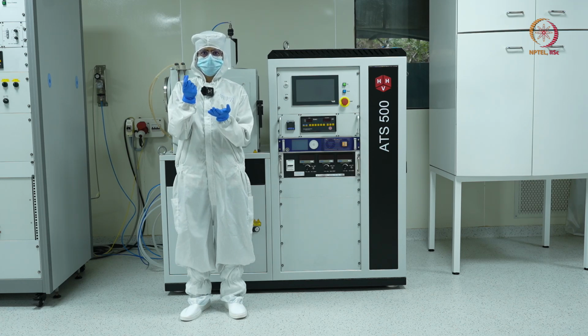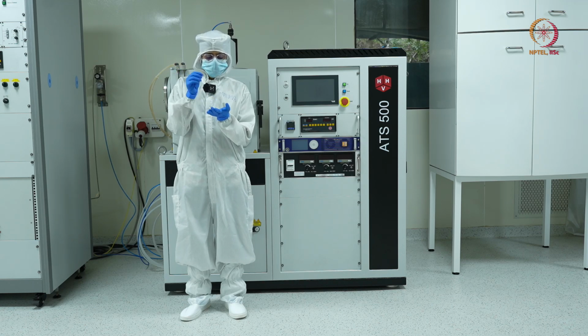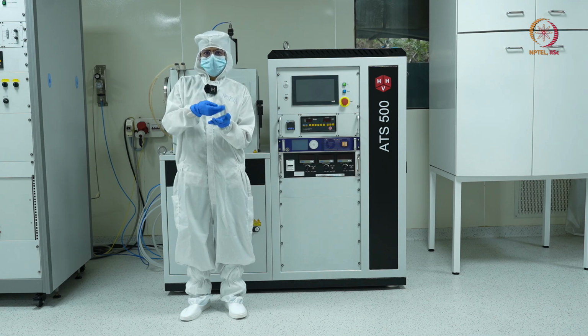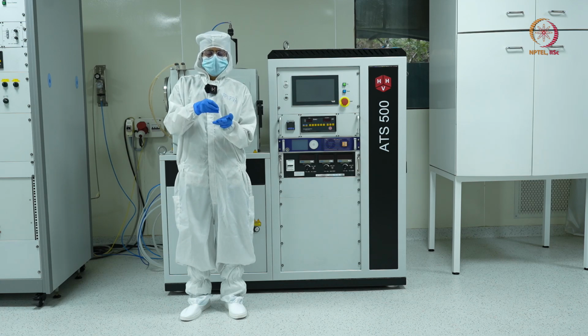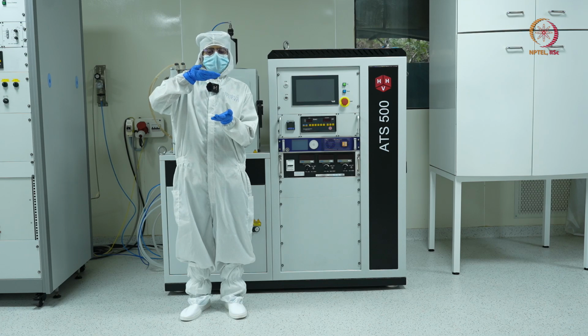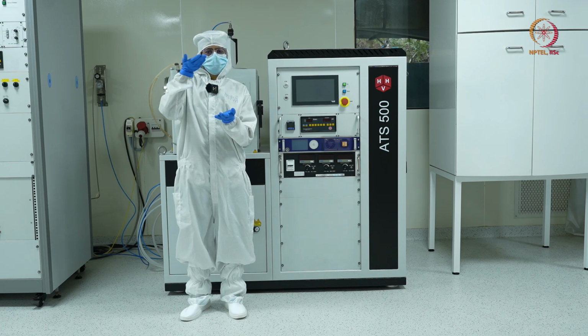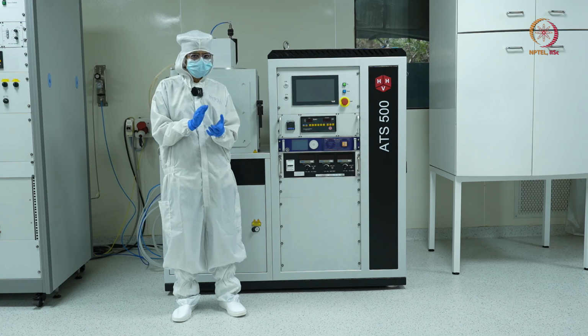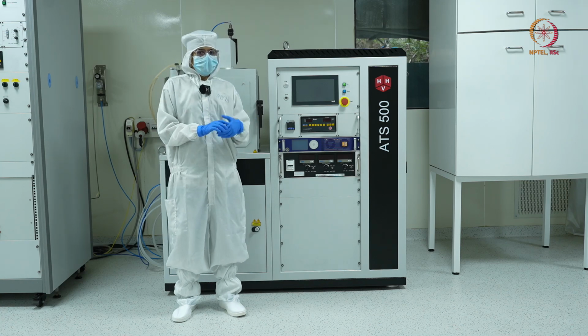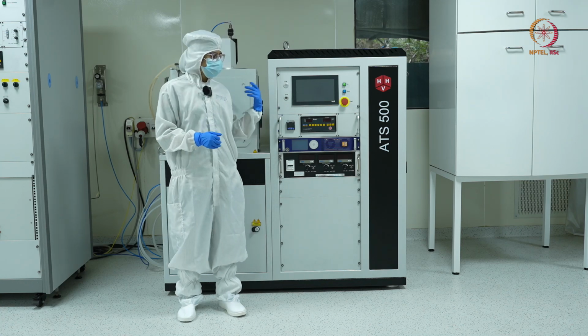So these positive argon ions will come and hit my target. Once they hit the target, they will dislodge or knock out the target atoms from the base material, and these knocked out neutral atoms will come and get deposited onto the substrate. So this is the basic theory for sputtering, and now we'll see how to operate this tool.